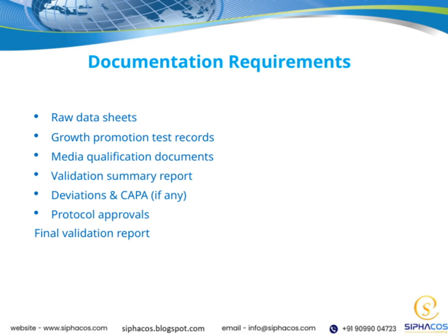Lastly, all these elements form the core documentation requirements that not only demonstrate compliance, but also support the integrity and reproducibility of our validation efforts. Connecting all these pieces is vital to ensuring our process is robust, reliable, and ready for regulatory review.